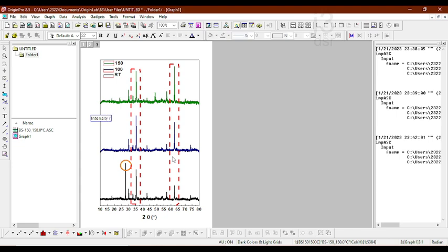Intensity has no units, it is arbitrary unit. Please put arbitrary units or AU or A dot U dot or something like this, so that it is convenient for people to know that it doesn't have a unit and you have just compared it. I'm going to see what font we have used here. We have used 28, so I'm going to 28, select all, Control A, 28.